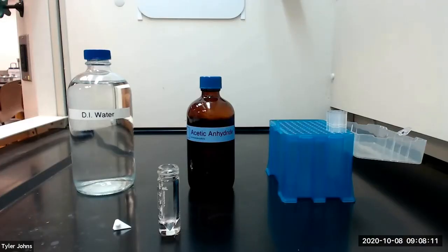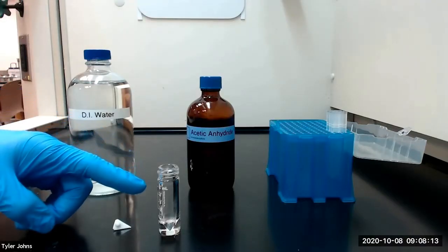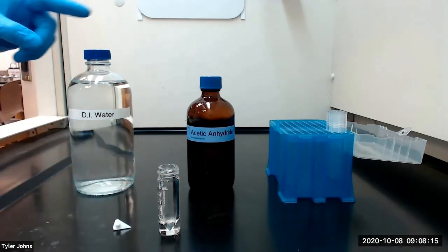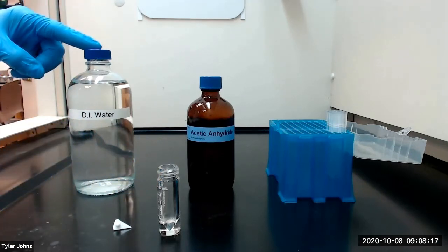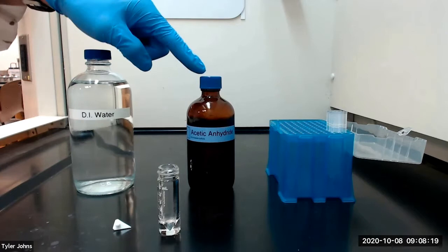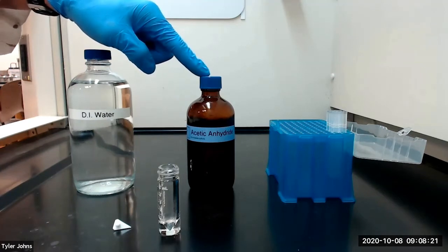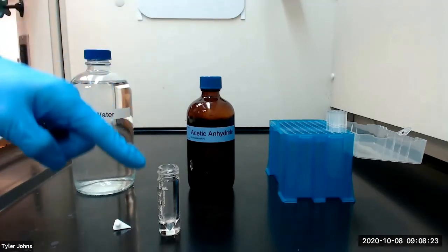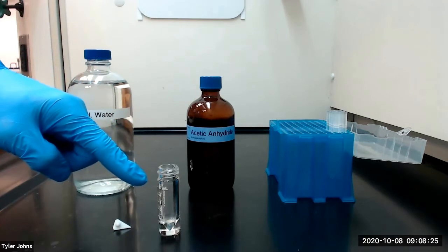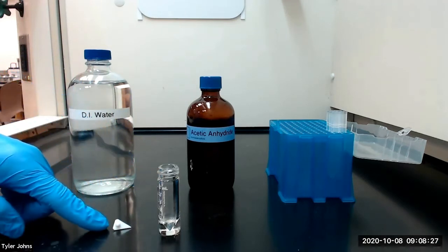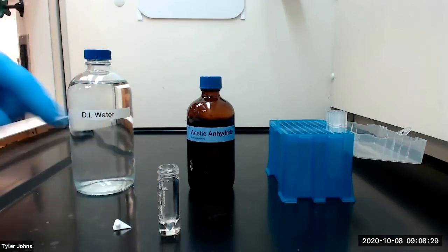We've transferred our P-aminophenol to our 5-milliliter conical vial. We're next going to add 450 microliters of deionized water and 165 microliters of acetic anhydride to the P-aminophenol in our 5-milliliter conical vial. We will also add a spin vane to our conical vial.